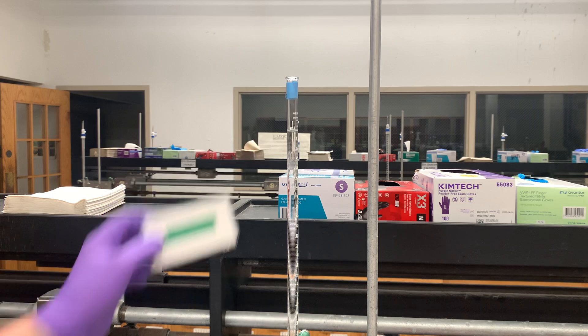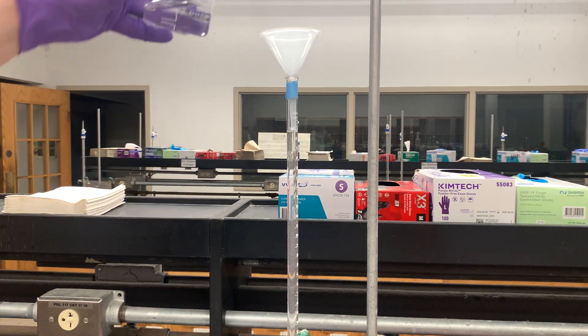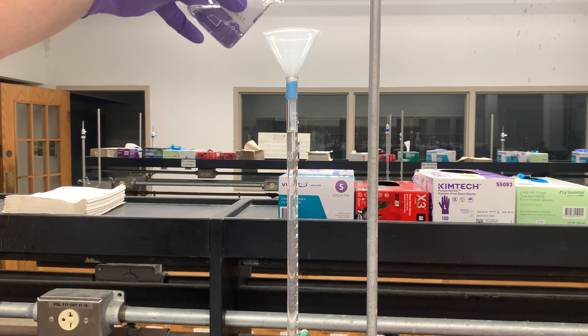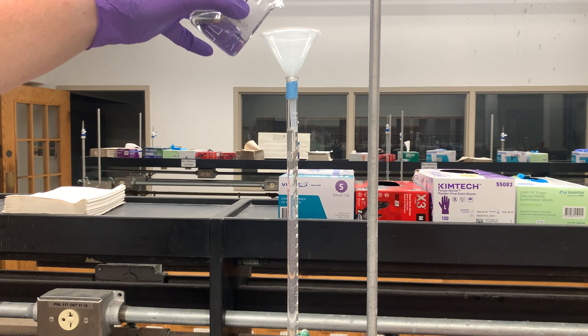I noticed that mine is not — it's just below. So what I'm going to do is add a little bit more sodium hydroxide because I want my meniscus to line up perfectly with 0.0 milliliters.